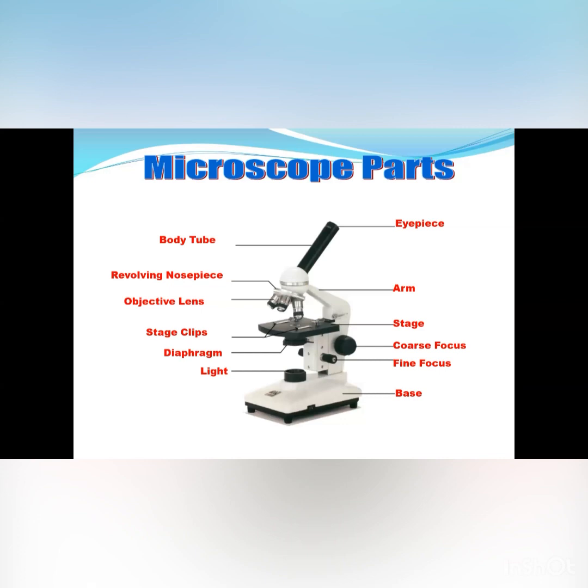The imaging system may also include elements such as filters, which select a certain portion of the light from the sample, for example to see only light that has been scattered by the sample, or only light of a certain color or wavelength. So this is important. The illumination and the imaging system play a key role in how well a light microscope performs. To get the best result in your application, it is essential to have a good understanding of how a basic light microscope works and what variations exist today.